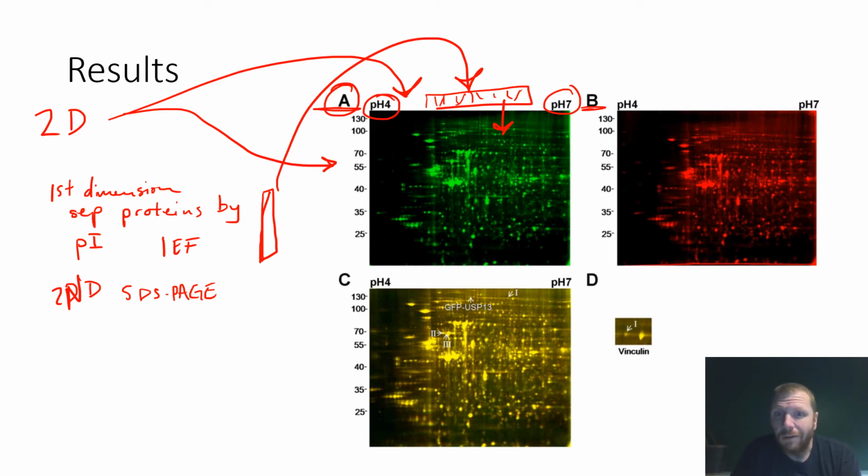But whenever I use a piece of software, it can detect those subtle differences and say, oh, this protein right here and this protein right here, they've changed. What about them has changed? Maybe the molecular weight has changed. Maybe the pI has changed. So if the molecular weight changed, then you ask the question, how much?